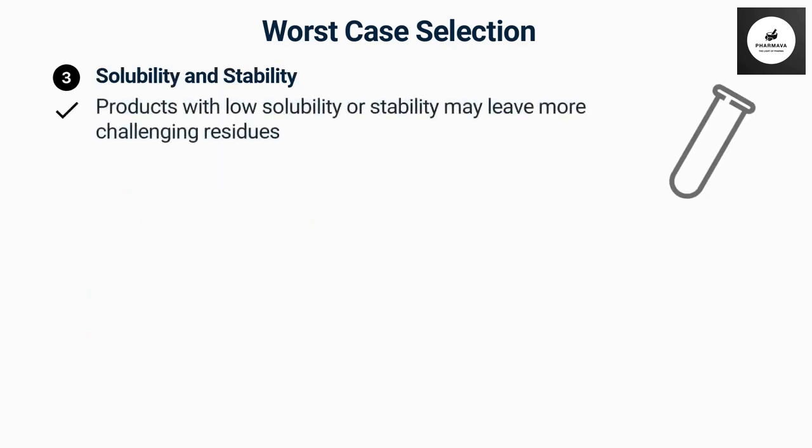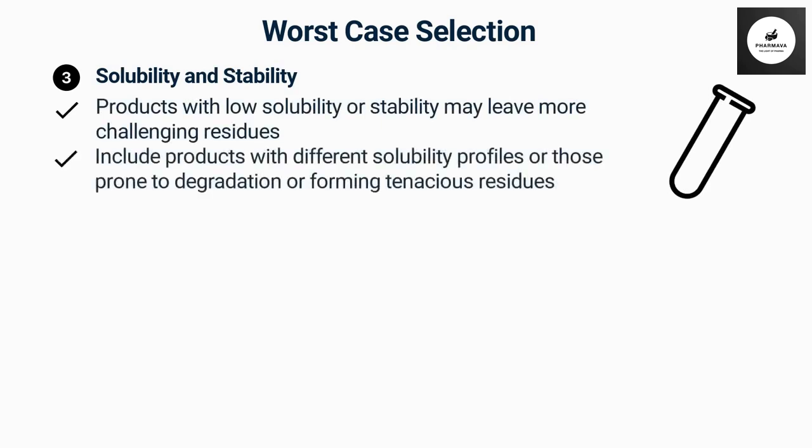Solubility and stability. Products with low solubility or stability may leave more challenging residues. Include products with different solubility profiles or those prone to degradation or forming tenacious residues.